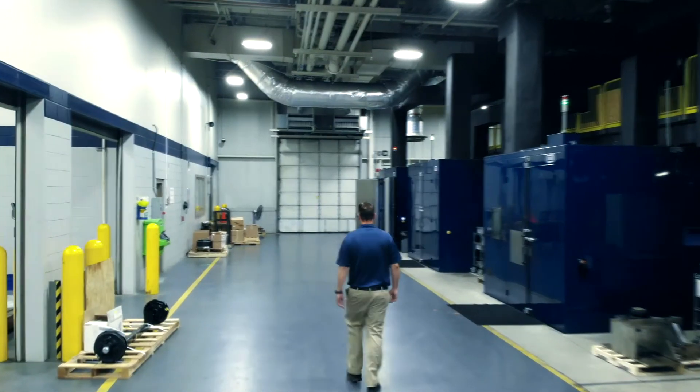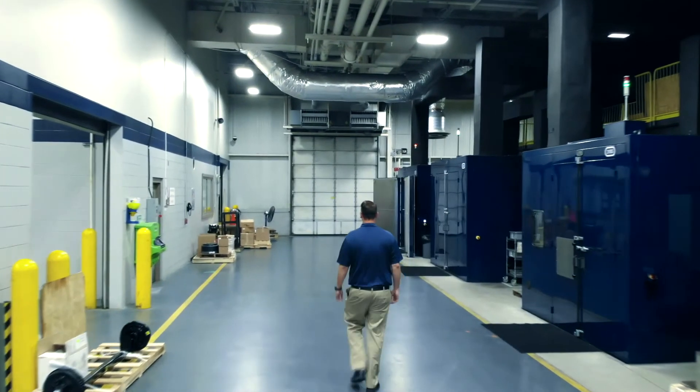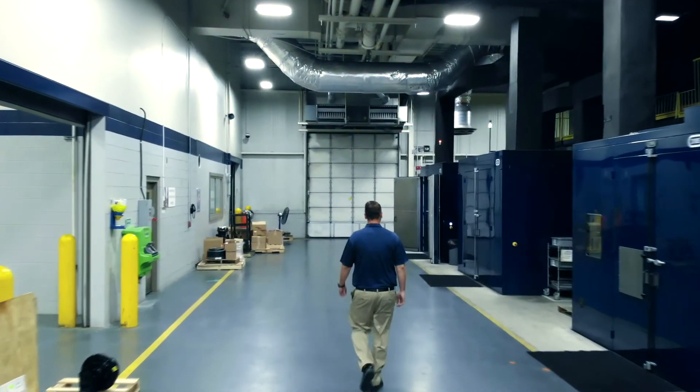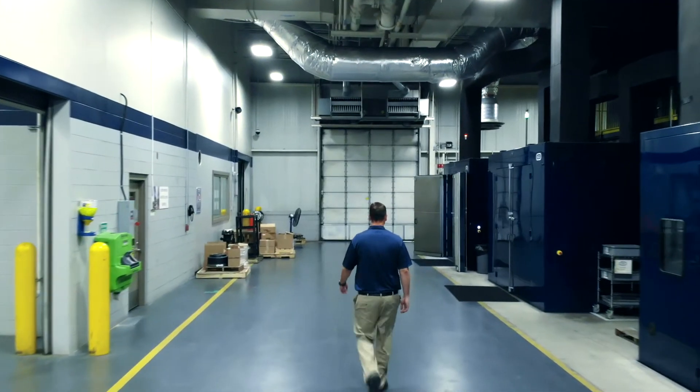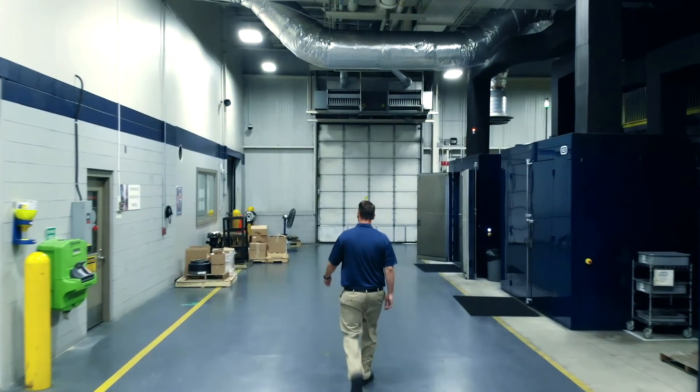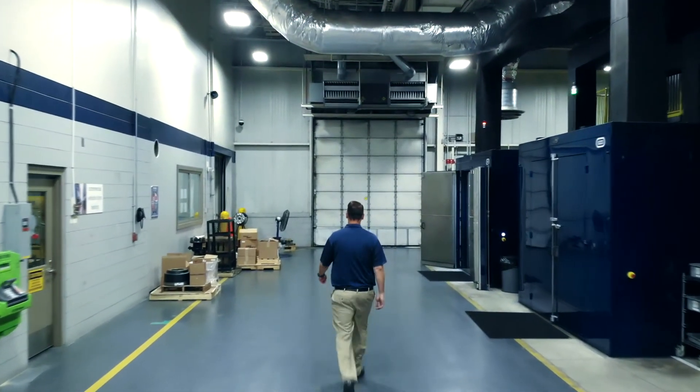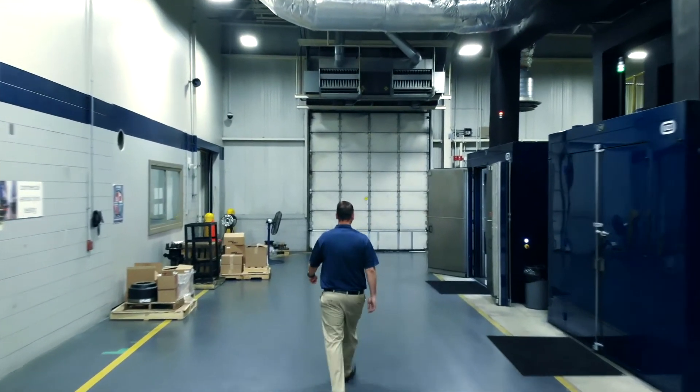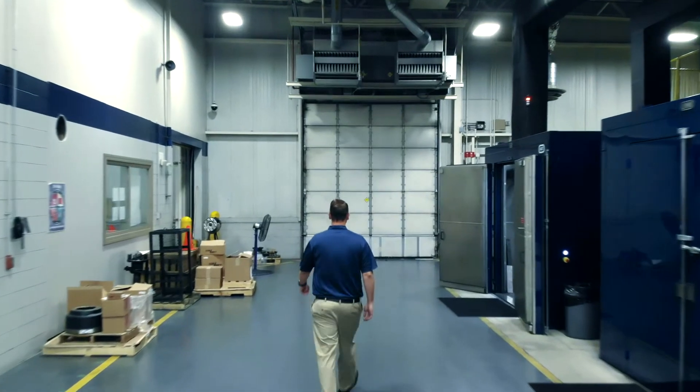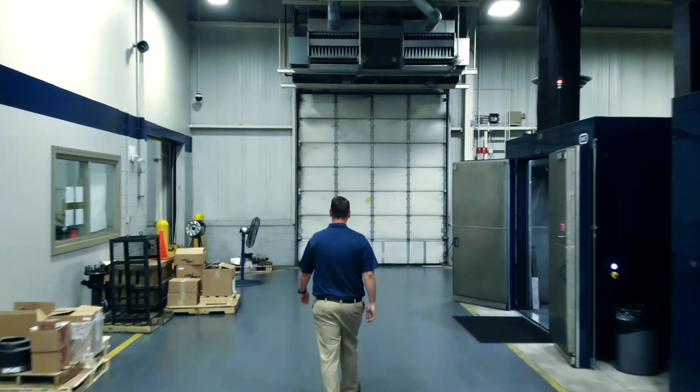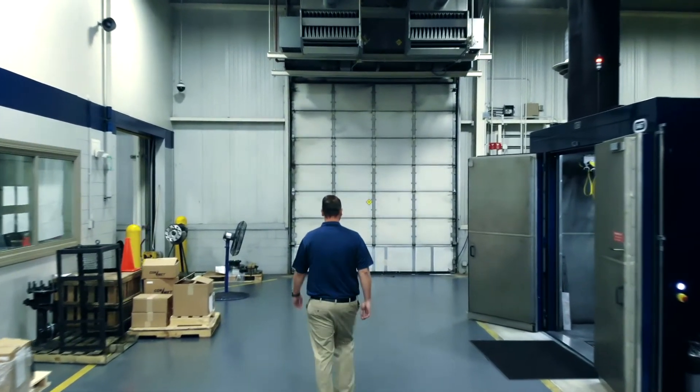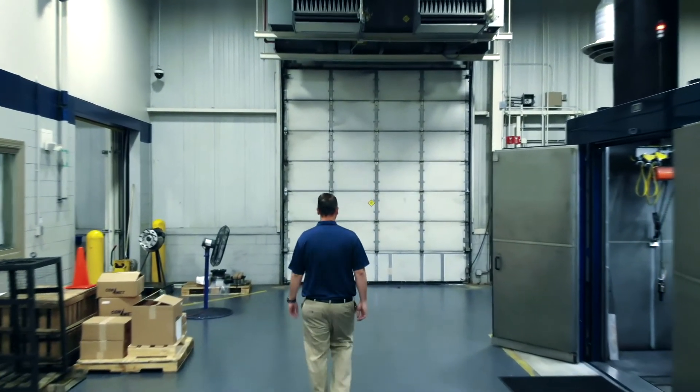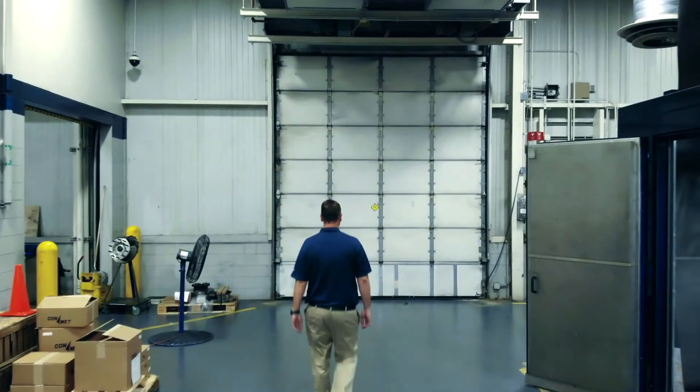With LabLink, our comprehensive LIMS, we can manage our laboratories from anywhere in the world. This feature provides our customers with unlimited connectivity, flexibility, and reliability.